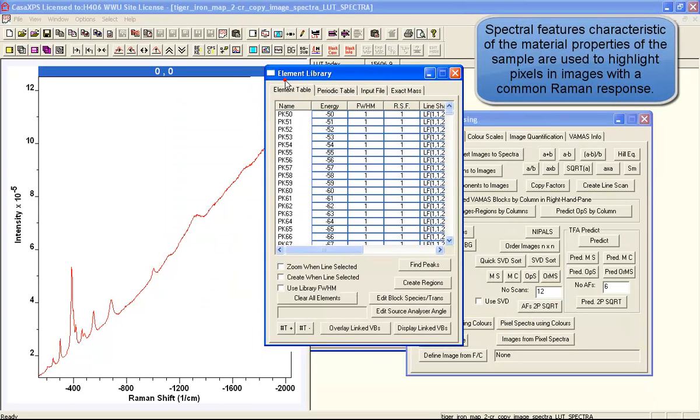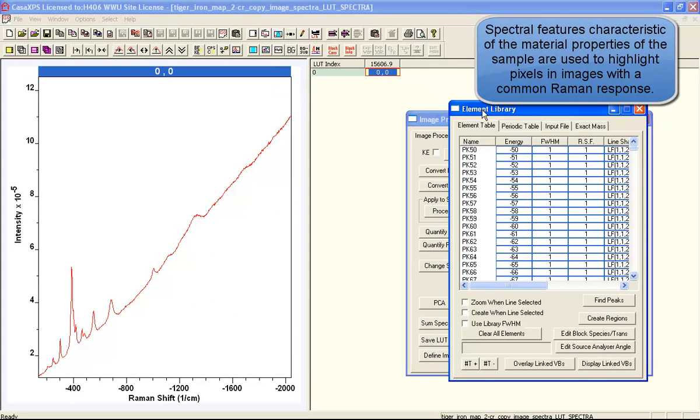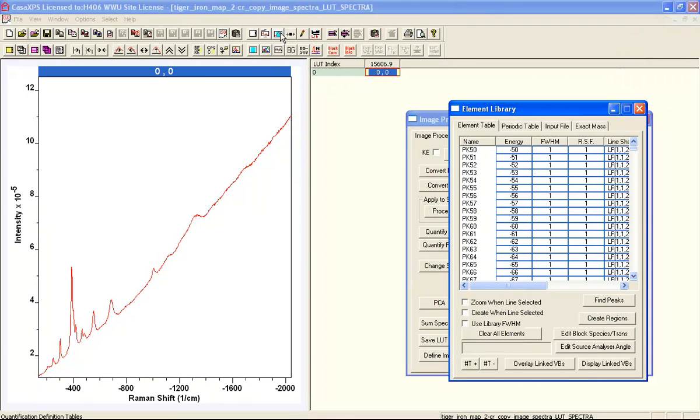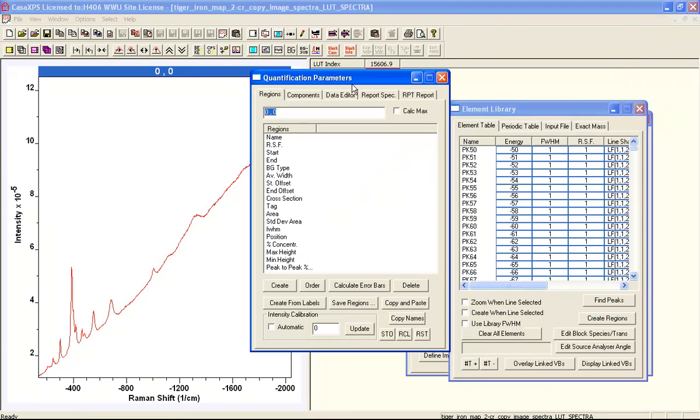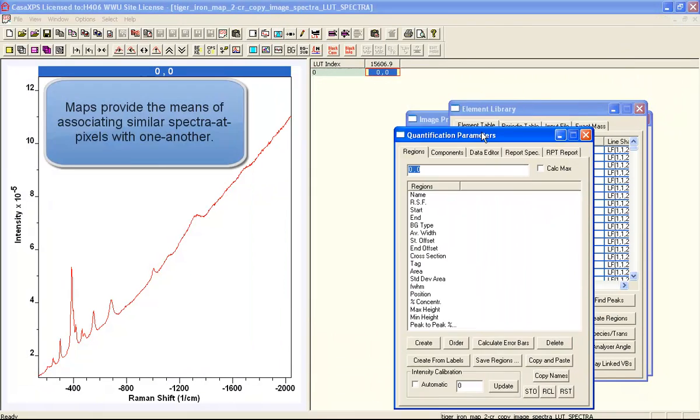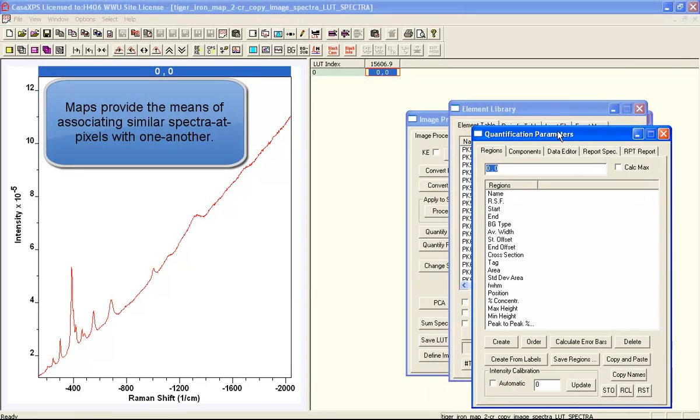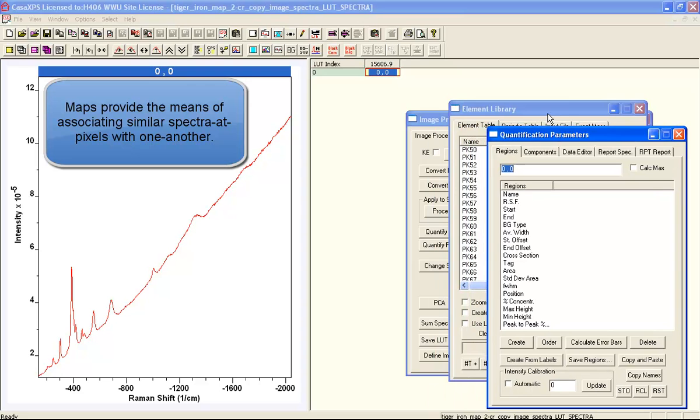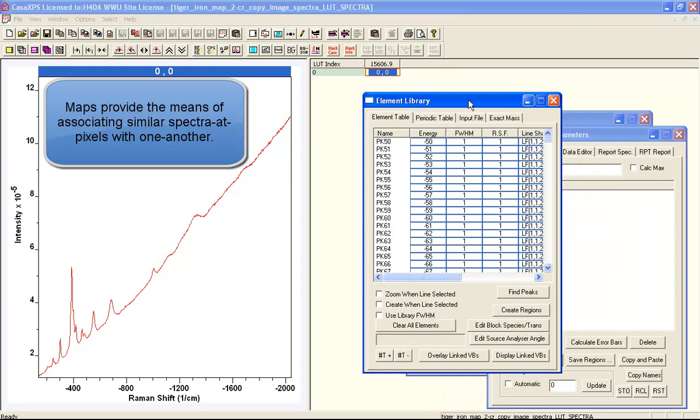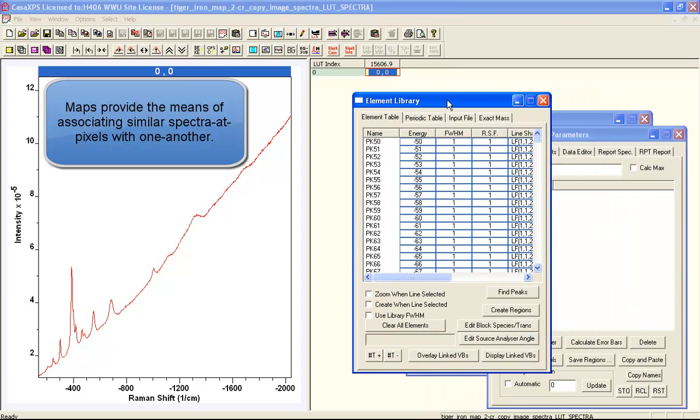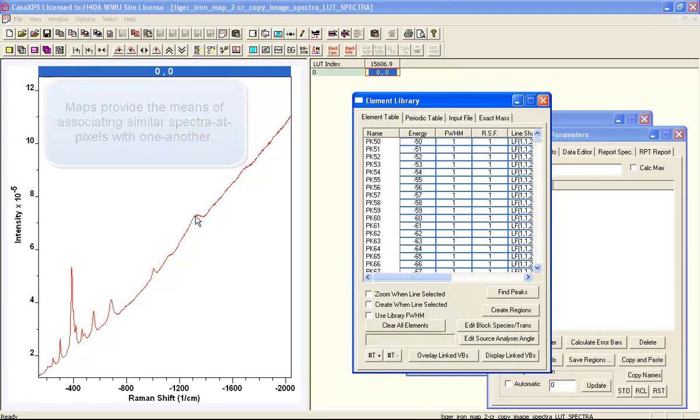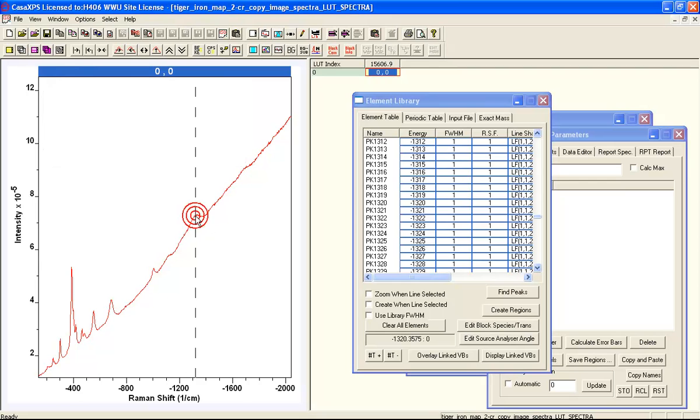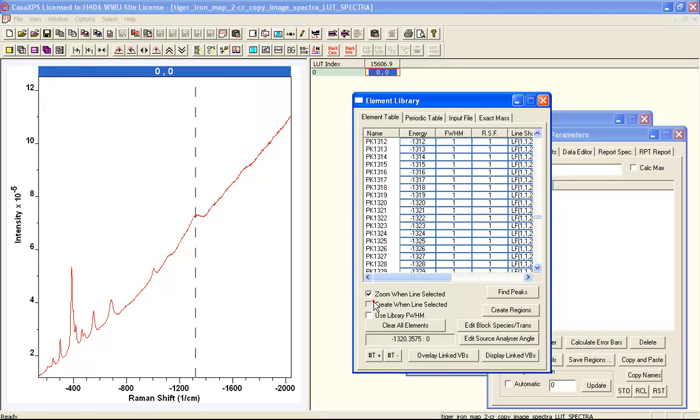In order to improve the signal-to-noise in the maps that we will create, these spectra will be integrated over intervals, that's quantification intervals, after background subtraction.